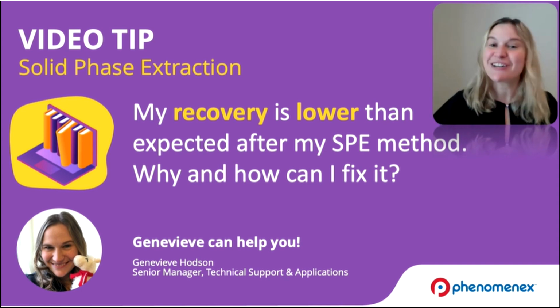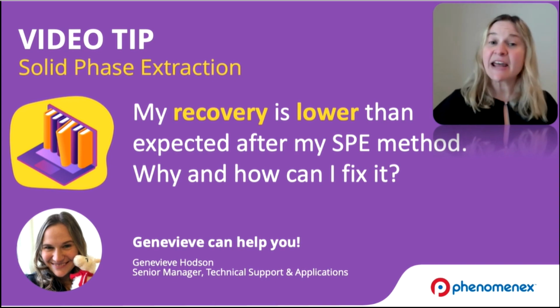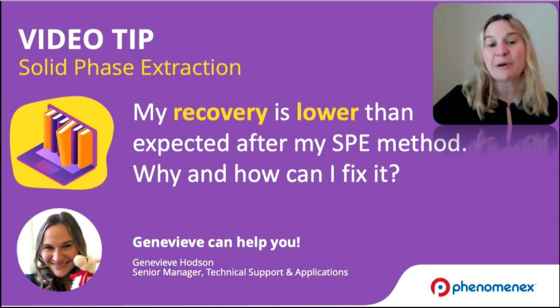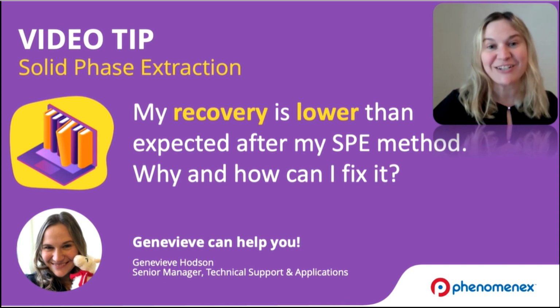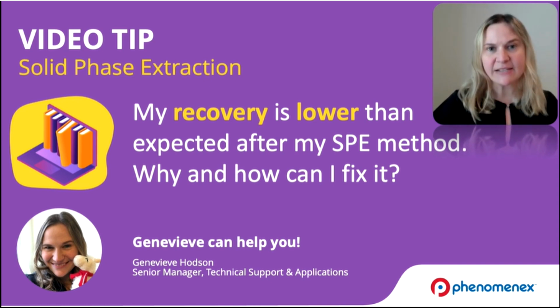I'm a senior manager here at Phenomenex for the technical support and applications team, and today I'm going to be covering a sample preparation or solid phase extraction tip. This one is a customer question. It is, my recovery is lower than expected after my SPE method. Why and how can I fix this?